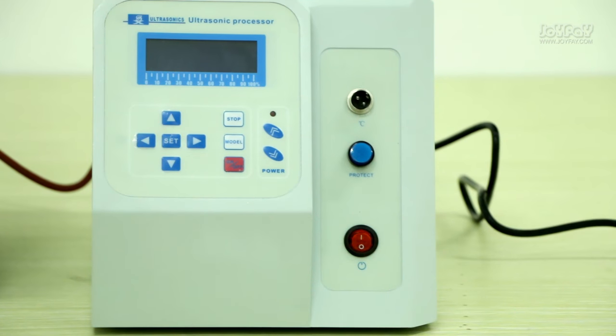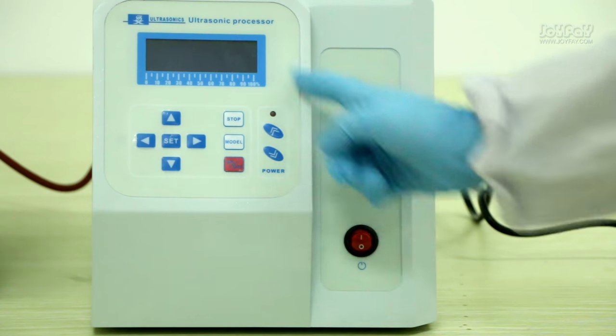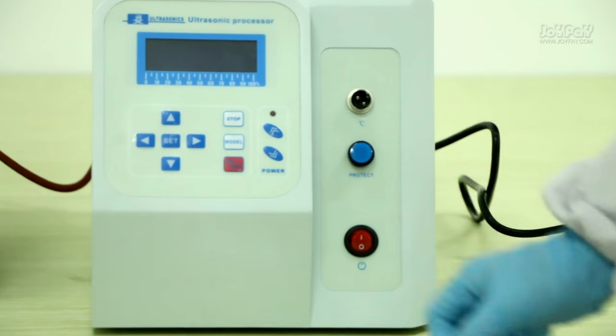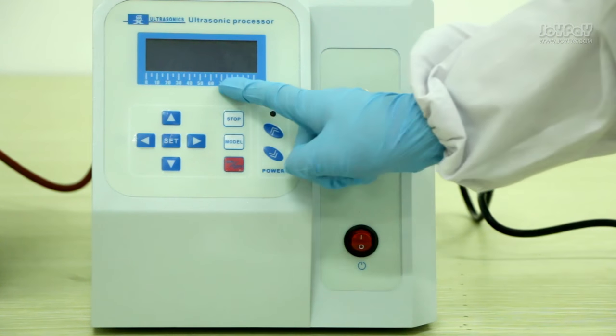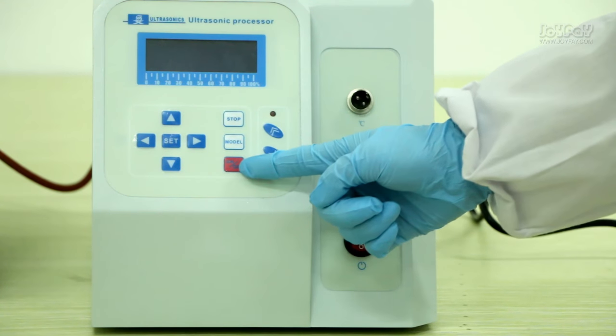Before starting, let me introduce the functions of each part. This is the operation interface, which consists of three parts. Let's start with the middle part, including the stop button, model button, and on or off button.